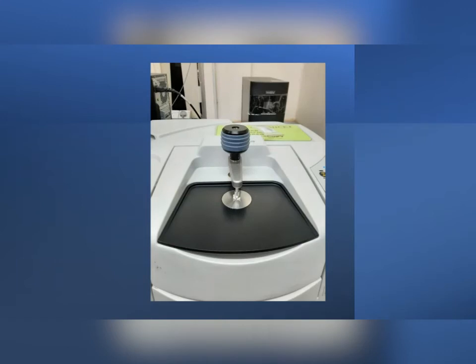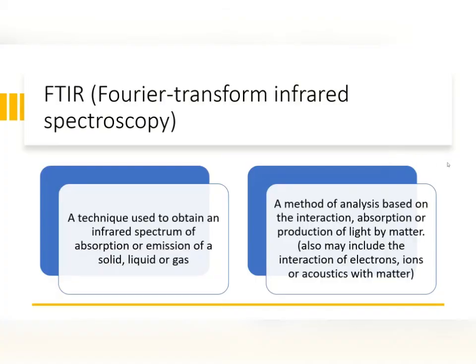Next, after the analysis of data, we take a few samples of the soap to be taken to the FTIR. FTIR is short for Fourier Transform Infrared Spectroscopy.